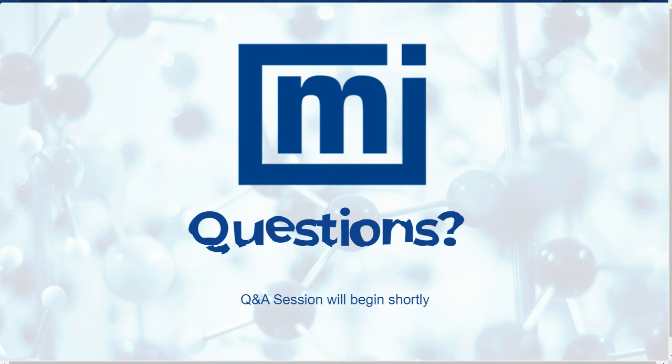Another question that came in was, so you've talked about a lot of different test methods on today's call, such as dynamic, bulk, and shear testing. Can all the different techniques that you talked about during your presentation be evaluated on one instrument? Yeah, okay, so that's great. Yes, the FT4 is designed so that it takes all of these different methods and it can apply them all. Because actually, if you're missing any one of those methods, really you're not getting the full picture. Powder rheology really relies on this interplay between these different testing methodologies, these different testing types.